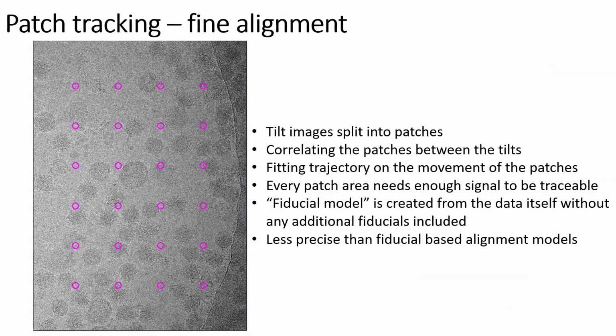But what if we don't have any fiducials because we forgot to add them when we prepared the sample? That's one case. The other case is that we could not put them there. For example, if we are freezing our cells, we can freeze our cells with fiducials. Nevertheless, when we thin our cells using a focused ion beam in the SEM microscope, we would mill away all the fiducials that are located on the surface of the cells, because we are taking a lamella that's located inside the cell. So for the lamellas, we cannot include any fiducials that will help us for tracking of the tilt series.